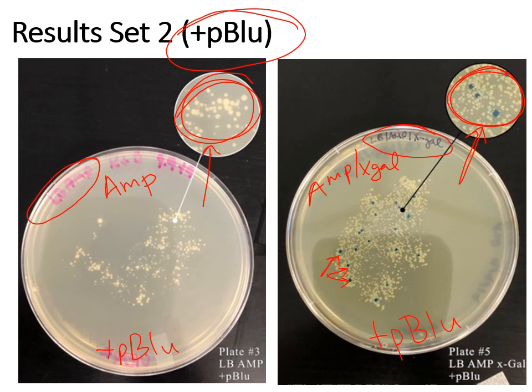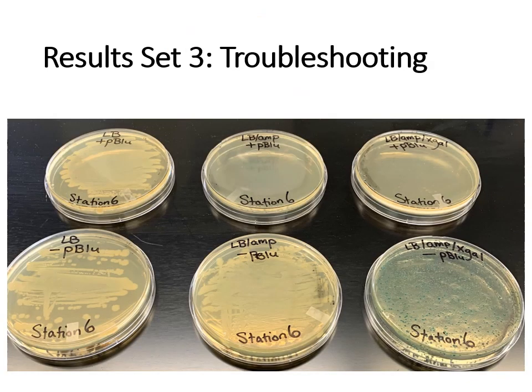And again, always ask yourself, what sample is it? What plate is it? What was I expecting? And what could have led to these results? Did they work, or might something have gone wrong? And that kind of troubleshooting is critical for the final result set that I will have you analyze. Again, these are all real plates, real results.